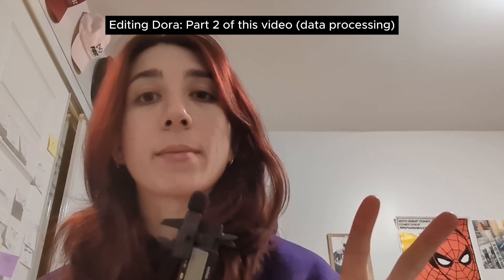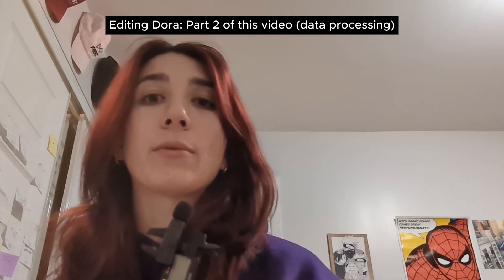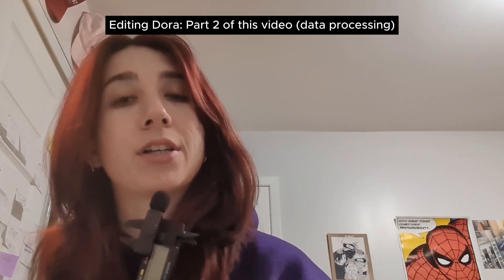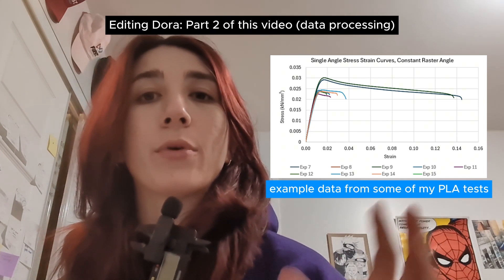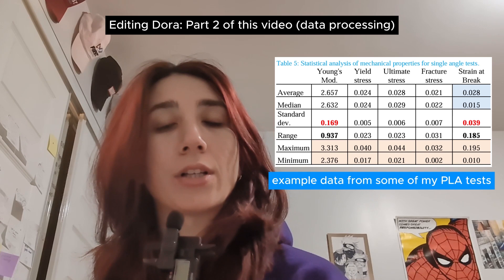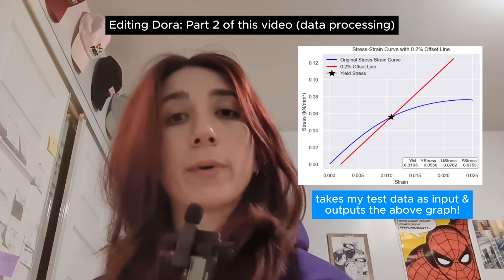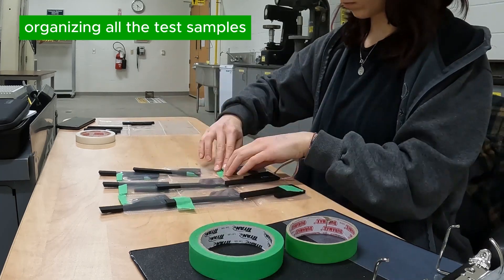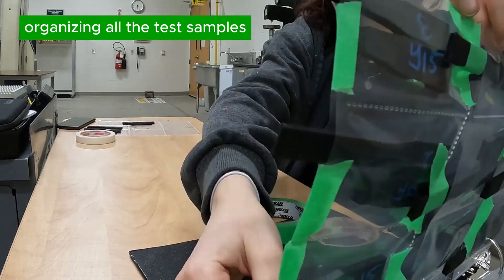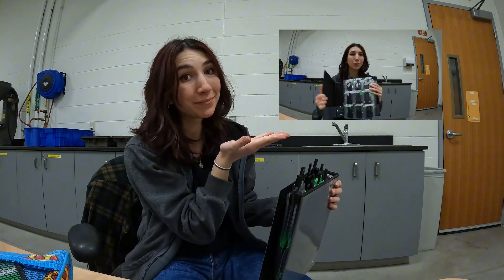I definitely want to do a second part to this video on how I process all the collected data, because the tensile machine returns a CSV file with only load in kilonewtons and extension in millimeters. Some conversion needs to be done to get stress and strain, then plot it and extract key values like ultimate stress, fracture stress, and Young's modulus. I've also been working on some Python code through Jupyter Notebooks and Anaconda, and I'd be happy to share that even though it's not the most elegant code. I've recorded the explanation in time-warp so there's a sped-up version if you're curious.